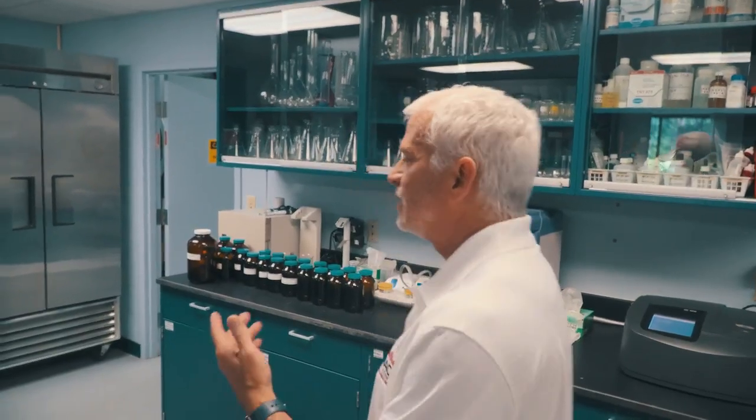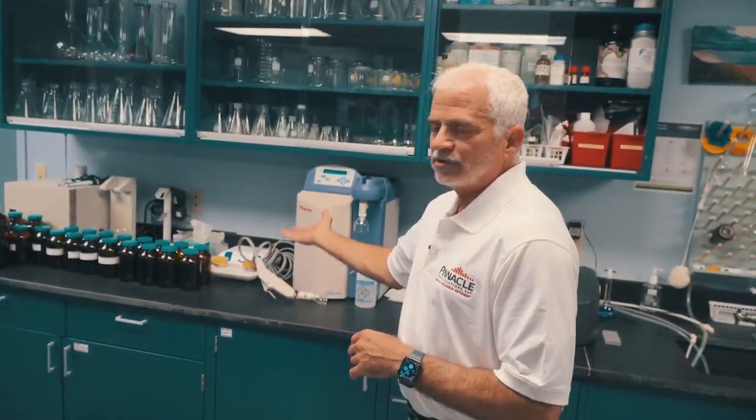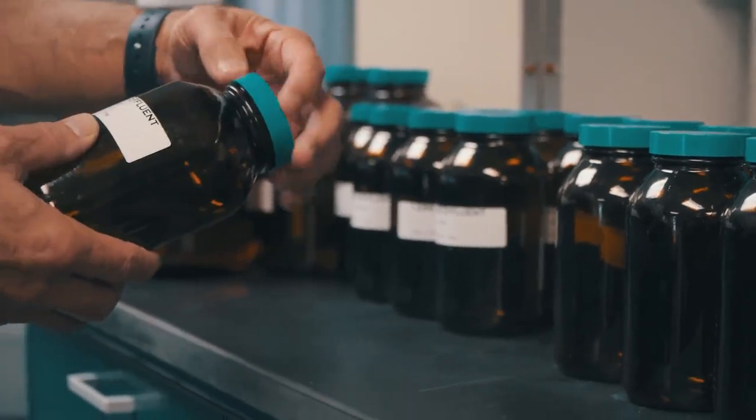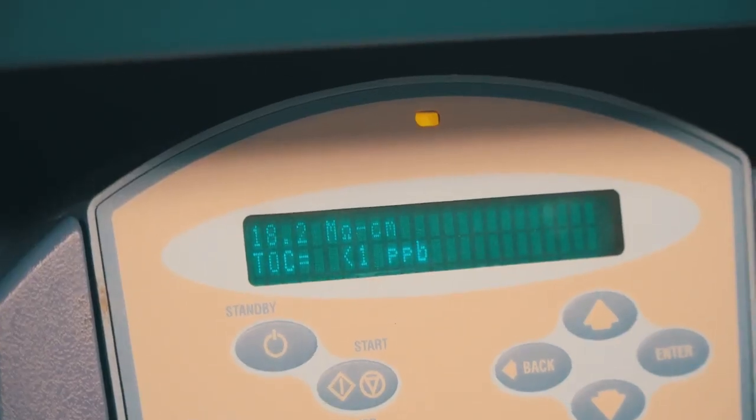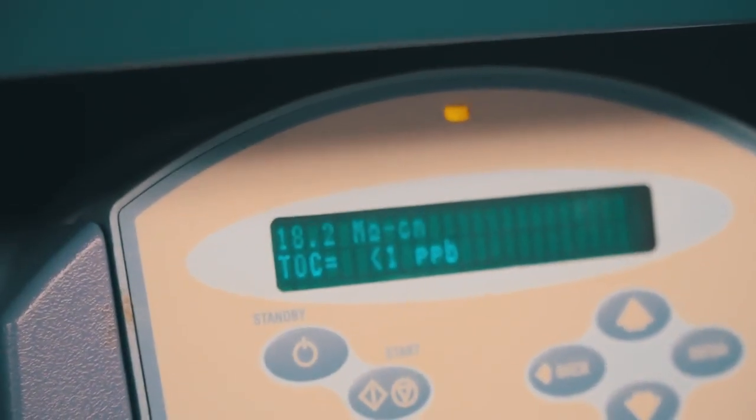In addition to that, we have areas where we can do bacteriological studies and do E. coli, total coliforms, fecal coliforms, and heterotrophic bacteria as well for dose and disinfection studies. We have, of course, traditional benchtop chemistry using a spectrophotometer for measuring key parameters like the indigo for ozone, ammonia, nitrite, nitrate, copper, iron, manganese, and so forth.